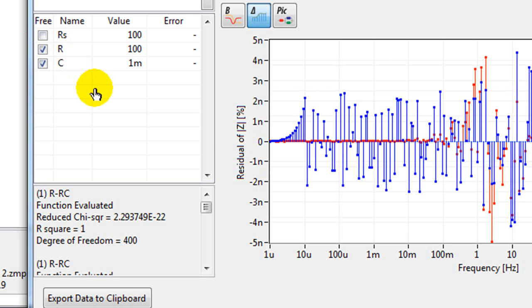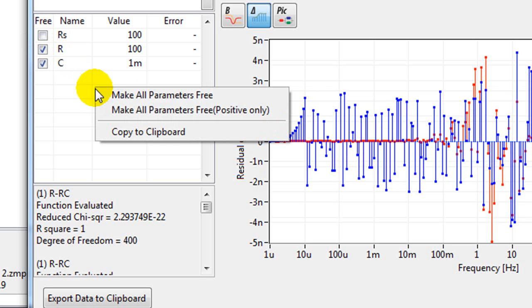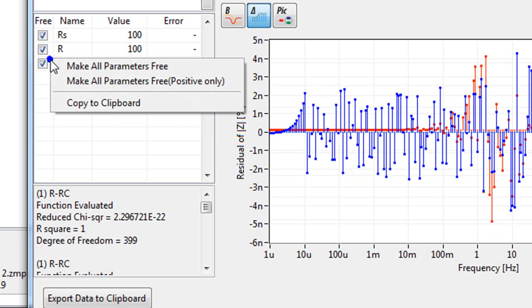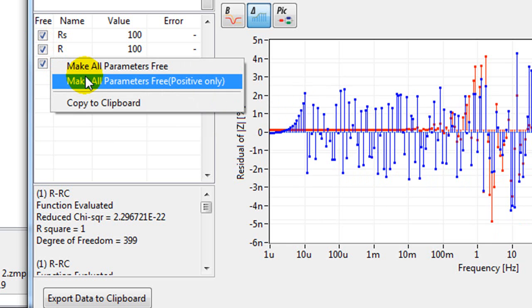If you right click in here, you can make all the parameters free, so they're all ticks. You can make all the parameters free but only positive.